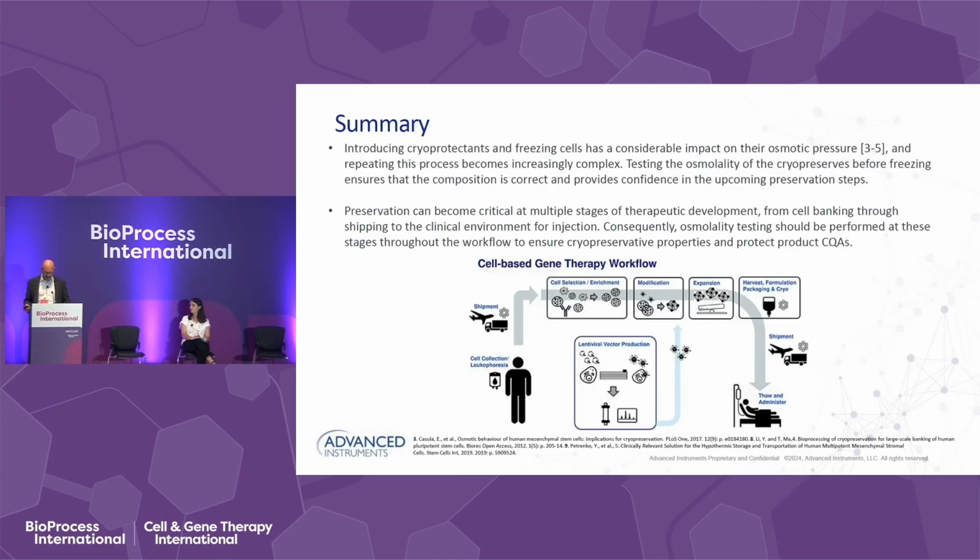So, to summarize, cryopreservation is a challenging process that is affected by numerous variables and can affect cell viability and recovery. Cryopreservative agents are complex solutions that are difficult to work with, but have to be in precise concentrations for the best outcomes. Osmolality is the one measurement that can be used to assure cryopreservative and the process are in balance to ensure the best recovery and viability out of your process.